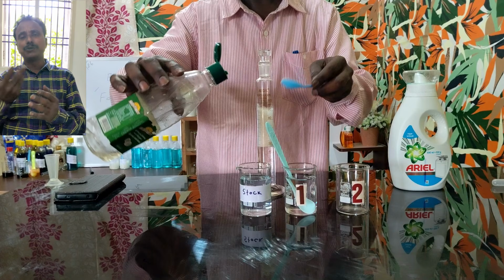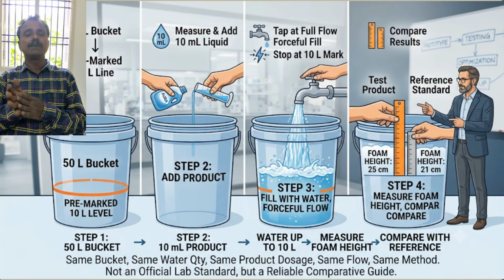And I would like to suggest one more simple method. Everyone can do it without this apparatus also. This is a very simple method for screening purposes. This is not actually for quality control measurements. Just for screening, just for an idea.